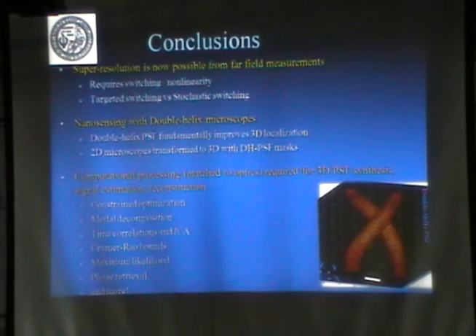We found out that double helix is not one design. There are different types of double helices, things like this. You can make this shorter range so that you get a double helix at a shorter distance. You can make the lobes smaller or bigger. You have different parameters with the double helix, and you can play around with those. And there are trade-offs.